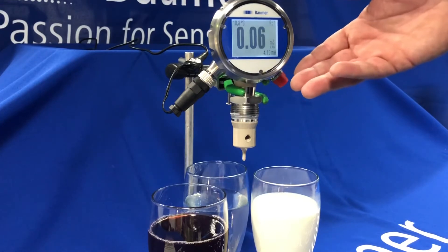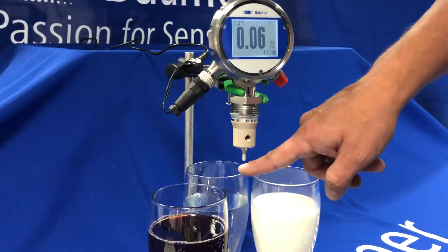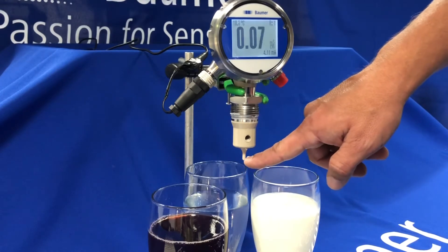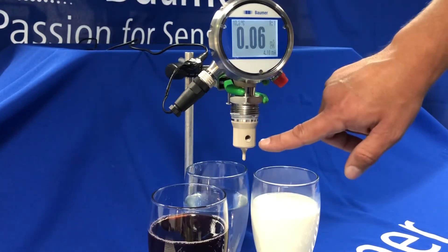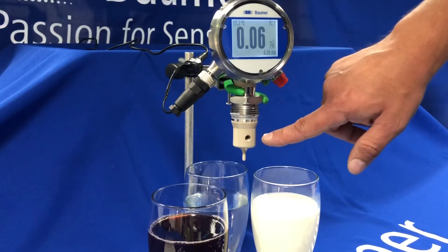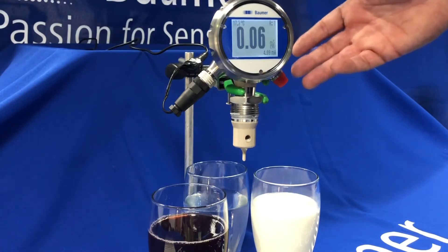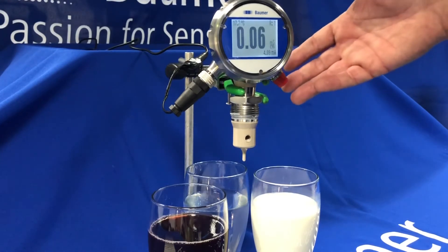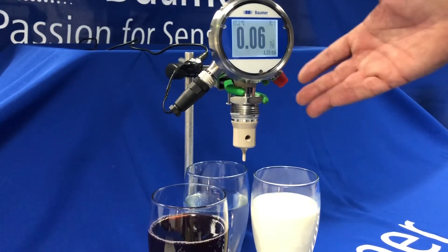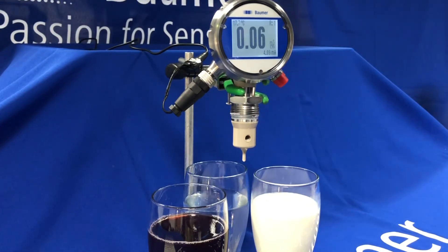It's very, very fast reacting, so you can save resources with the quick-reacting temperature tip. The sensor tip itself is made out of PEEK material, which is a food grade material, and everything else is made out of stainless steel — so all food grade. 3-A approvals are available, EHEDG approvals are available. That's our conductivity sensor.